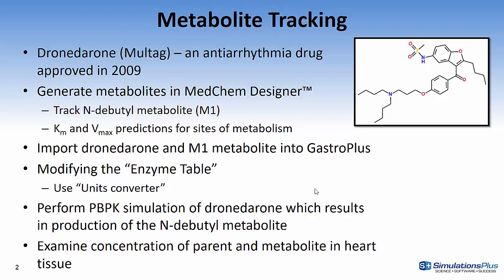And then I'll perform a PBPK simulation of Dronedarone which results in the production of the metabolite and then we'll examine the concentration of the parent and the metabolite in the heart tissue.